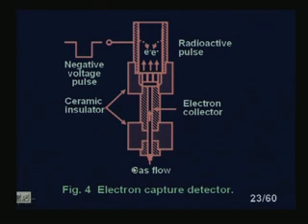Now, the electron capture detector has two electrodes within, with the column effluent passing between. One of the electrodes is treated with radioisotopes that emit high energy electrons as they decay, and these emitted electrons produce a large amount of low energy thermal secondary electrons in the gas chromatography carrier gas, all of which are collected by the other positively polarized electrode.